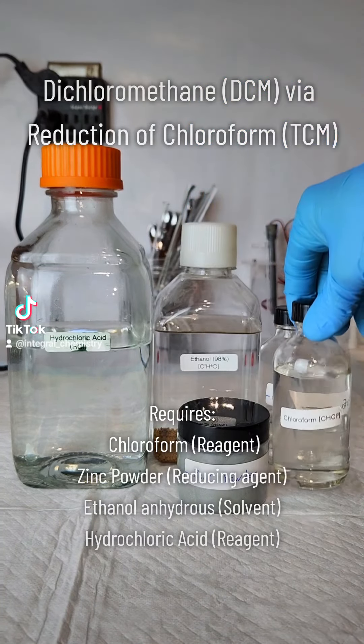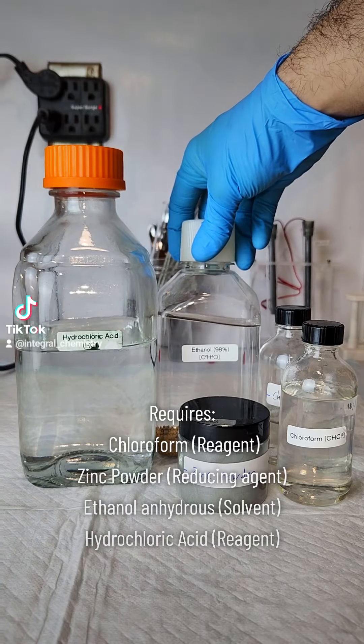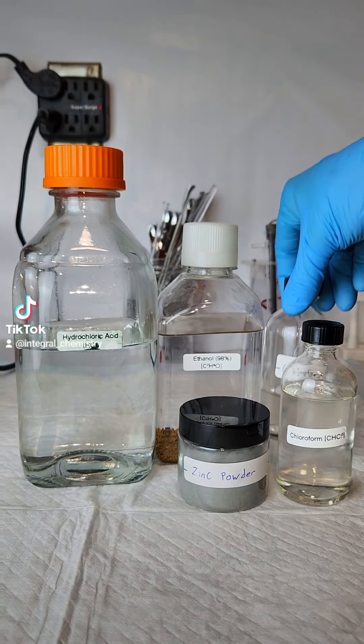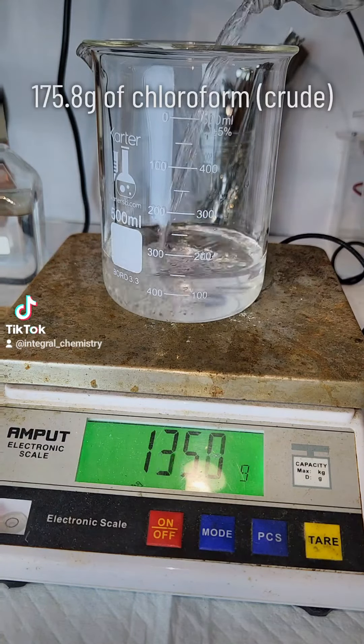So today, I'm going to take that chloroform I made the other day and use it to try and synthesize some dichloromethane. I'm going to do this by reducing the chloroform with zinc metal in the presence of hydrochloric acid.